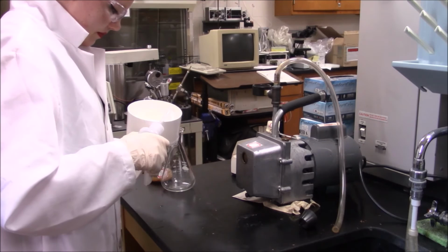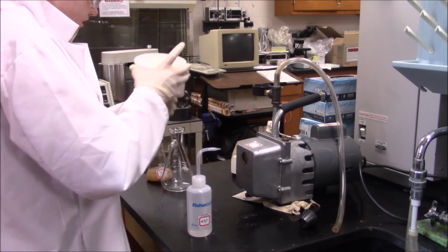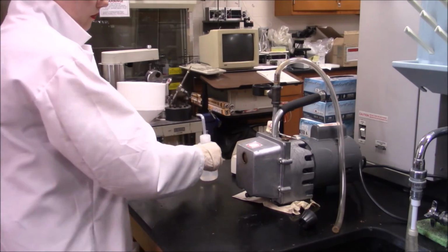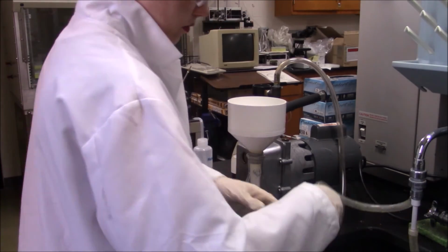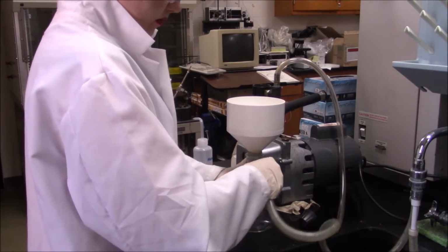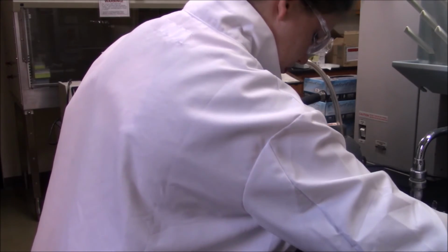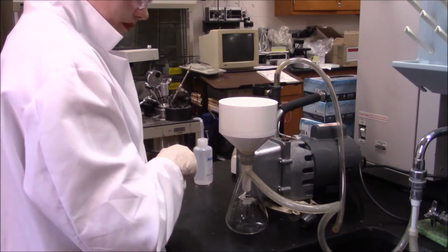Once fermentation and enzymatic hydrolysis are complete, as indicated by a lack of carbon dioxide production, the biomass must be filtered out of the flask containing the wood chips. This should be accomplished using a Buchner funnel, a Buchner flask, and a sink suction device. To filter out the biomass, first put the 110 millimeter filter paper into the top of the Buchner funnel and dampen around the edges. With the rubber stopper, attach the Buchner funnel on top of the Buchner flask.